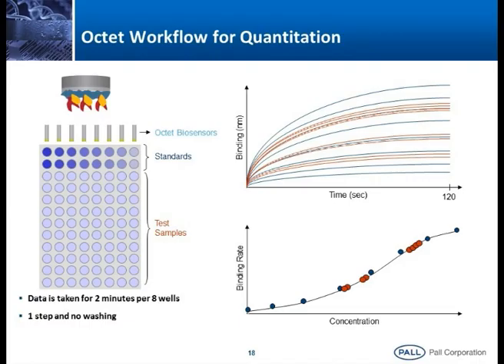But here the advantage is that it is purely affinity based. For UV, I am giving an example, you people perform the Bradford assay, right? What you are doing is total protein quantitation, not exactly the protein of your interest. Even with HPLC, at 280 monitoring, it is once again resolving, but you do not know how pure your peak is. There may be other proteins with the same hydrophobicity that elute at the same time. Here it is a purely affinity based interaction. If you have a specific antibody or a specific receptor, then we can easily quantitate how much protein is in your expression.